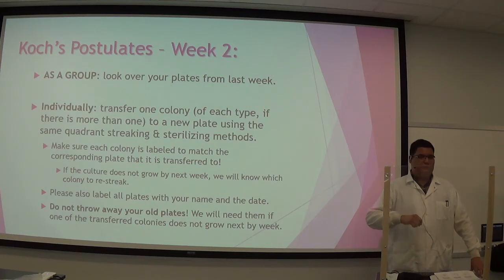And just do that quadrant streaking technique again. Make sure everything's sterile, make sure you don't contaminate anything. If you contaminate anything, I've got extra plates here, so just let me know. And if you do everything correctly, then you should have pure cultures for next week.